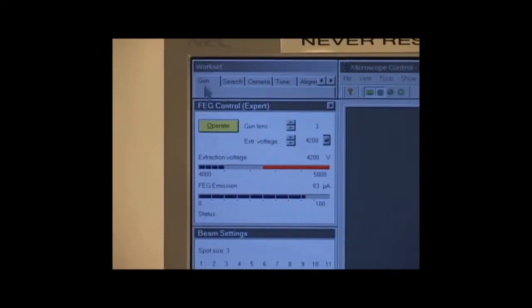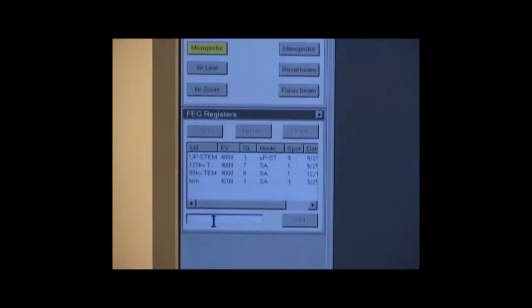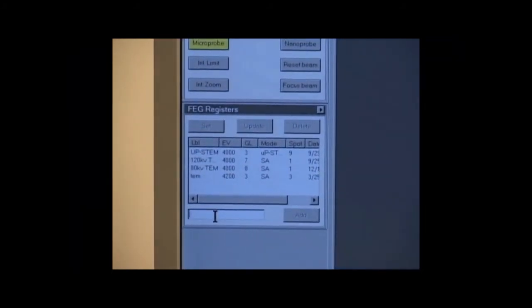Click Gun, FEG Registers. Type a name like T-E-M, and save the alignment settings for future use.